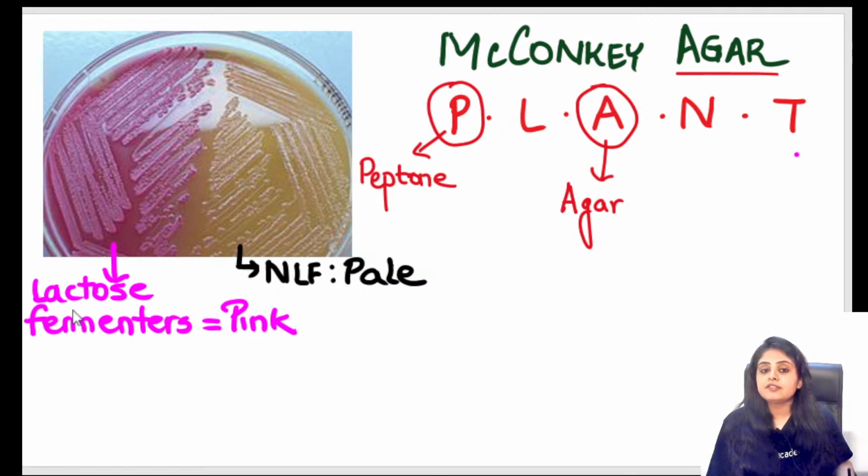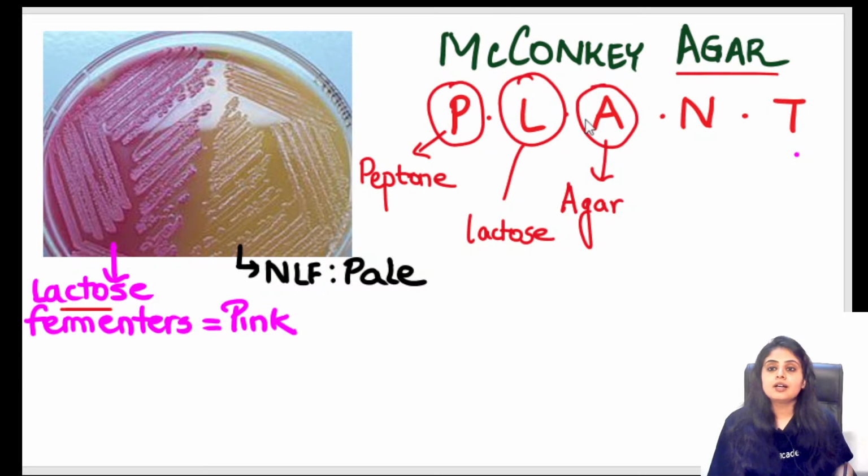What am I trying to test? I am trying to test for lactose, so I have to add lactose in the medium. So these three are obvious: peptone, lactose, agar.